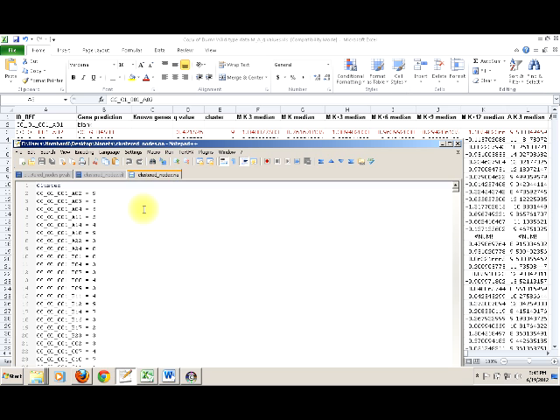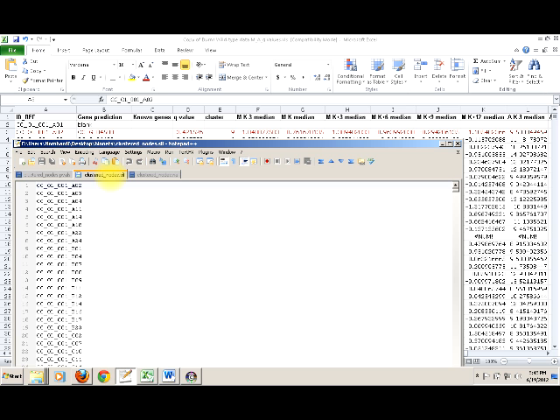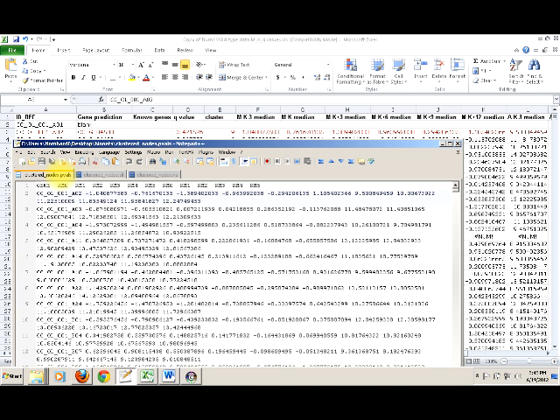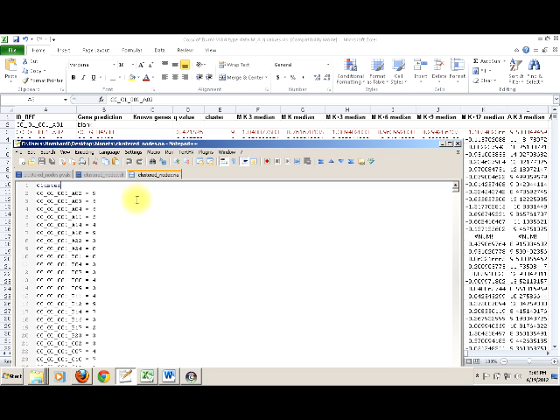The third file is simple. We want to add an additional attribute to each node representing the cluster it's in. The file format starts with the cluster, and for each node (each gene) we assign it to a particular cluster. The A02 gene is in cluster nine, and we can see that matches the value in the spreadsheet. I simply read in the comma-separated values and rewrite them as needed by Cytoscape: the SIF format for nodes and links, the pvals for gene expression data, and any additional data like cluster assignments.